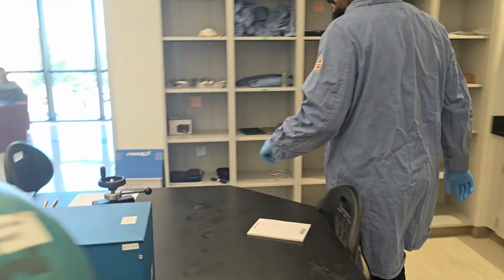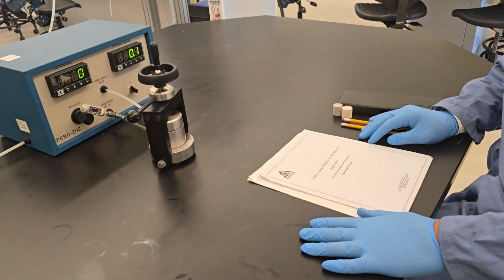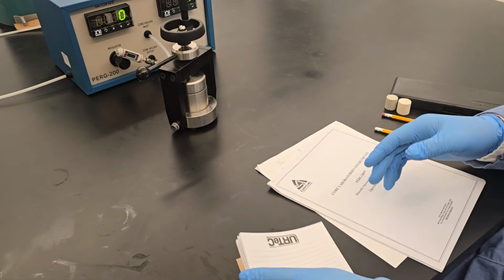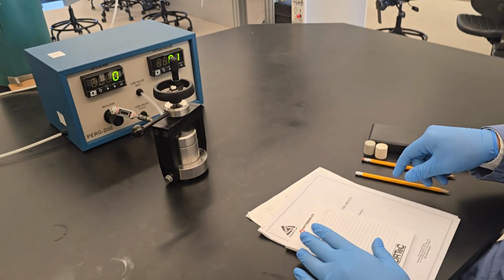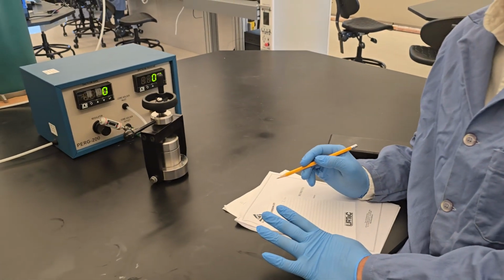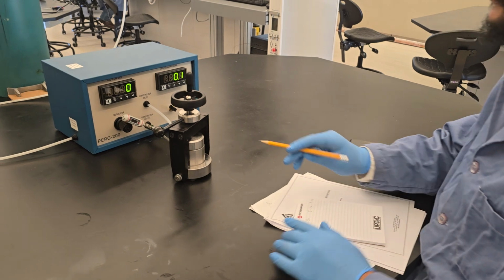Once I'm done with that part, I come back here and start running my experiment. So in this experiment, we need to run multiple measurements. We need at least 4 data points, which means we need to run the experiment at at least four different pressures and measure the flow rate at those 4 pressures.